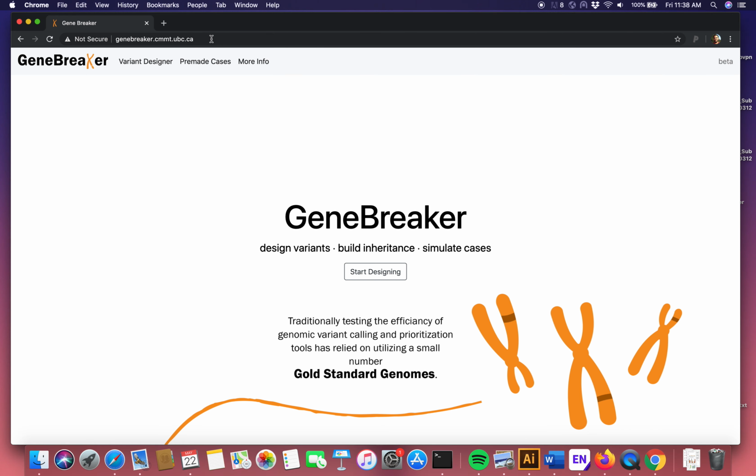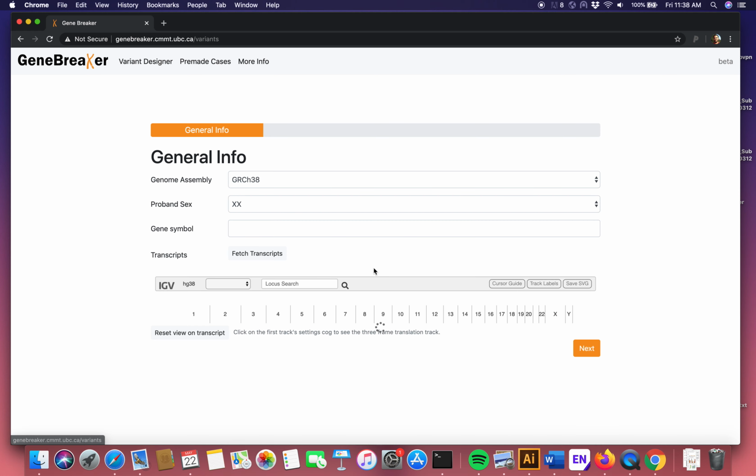So if you have gotten here from YouTube, briefly the website is genebreaker.cmmt.ubc.ca, and we're going to jump into the design process.